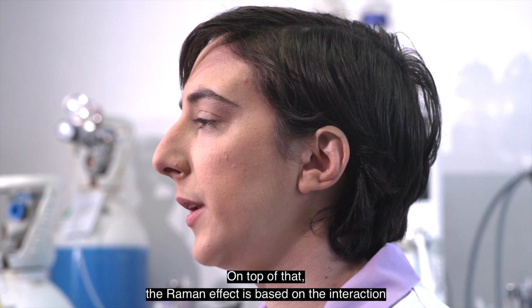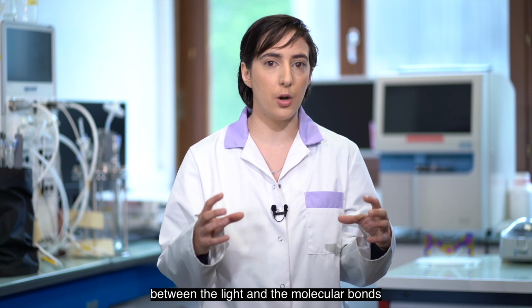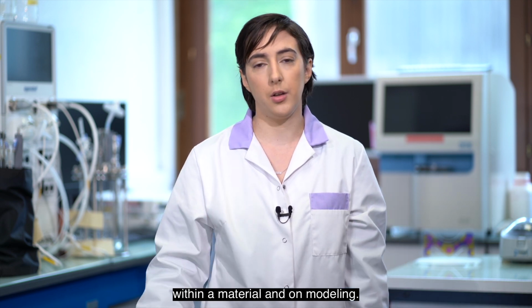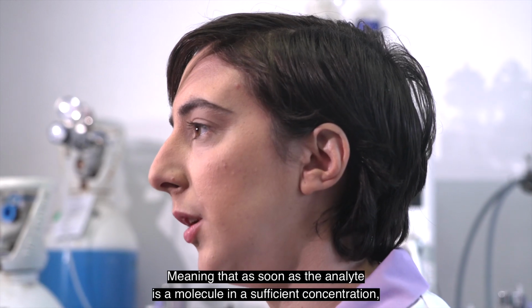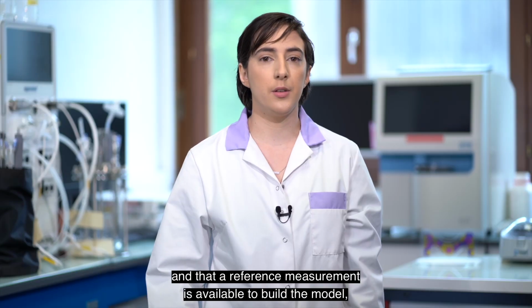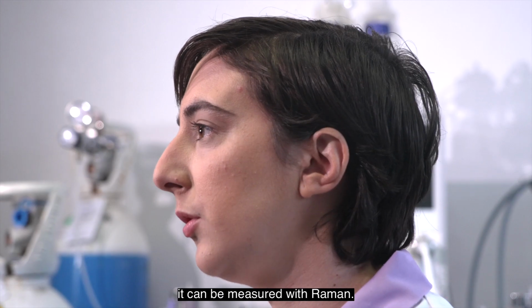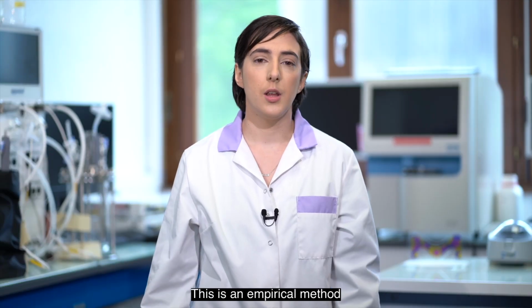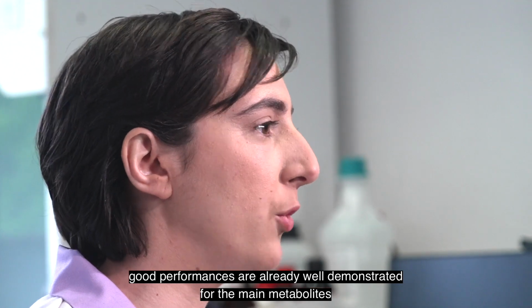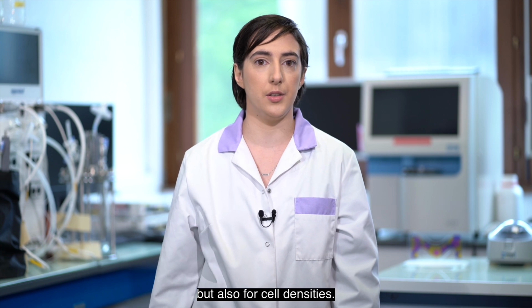On top of that, the Raman effect is based on the interaction between the light and the molecular bond within a material, and on modeling. It means that as soon as the analyte is a molecule in a sufficient concentration and there is a reference measurement available for model building, it is possible to measure it with Raman. The possibilities are almost infinite. This is an empirical method. Good performances are already demonstrated for the main metabolites such as glucose, lactate, but also for cell densities.